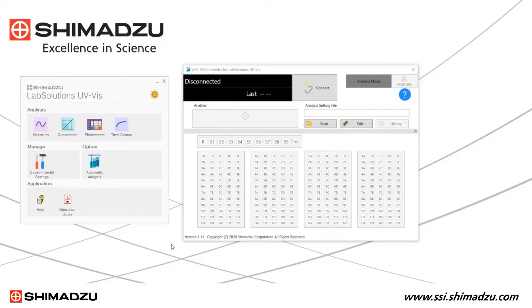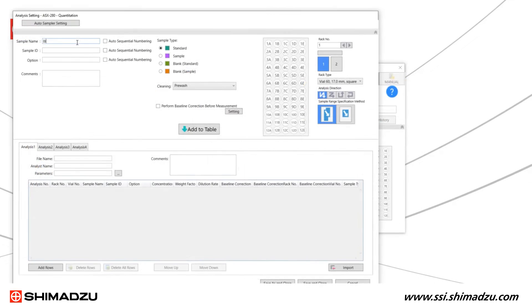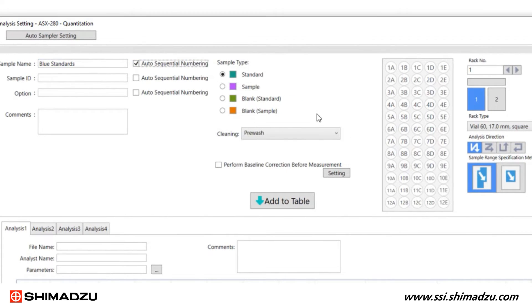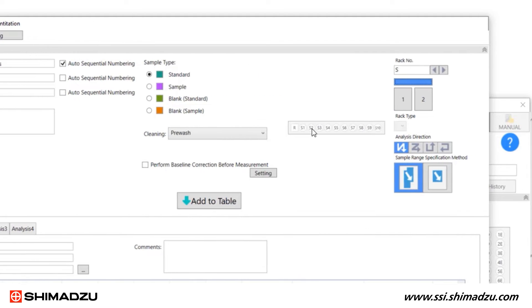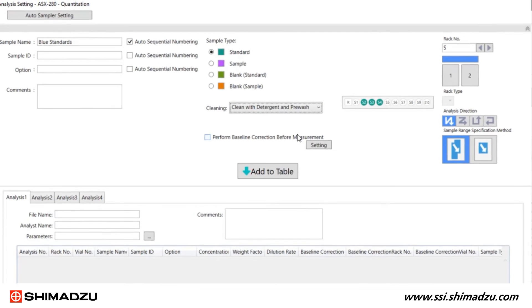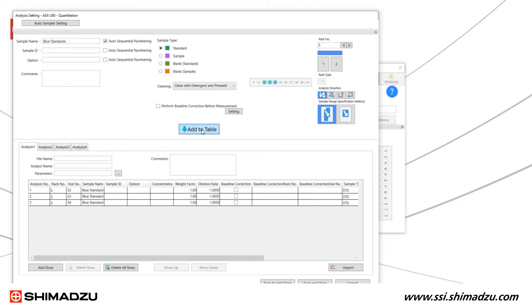To set the parameter file for the auto-sampler, click Edit. Select Quantitation for measurement mode, then select the correct auto-sampler model, then click Next. In the Setup window, enter sample information. In the Sample Type section, select Standard, then assign vials S2 to S4 as standard samples. Select a cleaning mode and indicate if baseline measurement is to be performed. Click Add to Table — the standard sample information will populate the lower section of the window. Enter the concentration of the standard samples one by one.